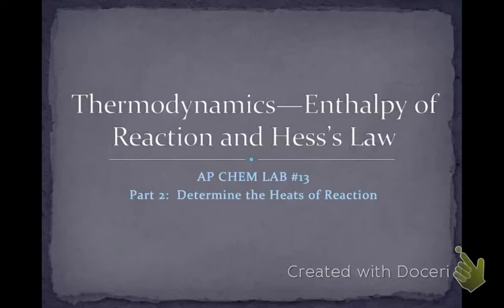Today we will cover part 2 of the Hess's Law Lab. The procedure is found on page 4 of the lab handout. So today we will review the procedure. I will give you all the data that you need to then do the calculations and the graphing. So that's what we're going to cover in today's lesson.